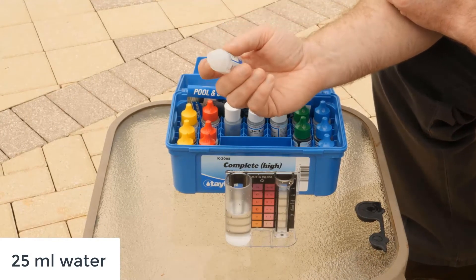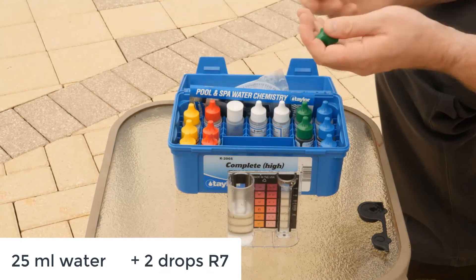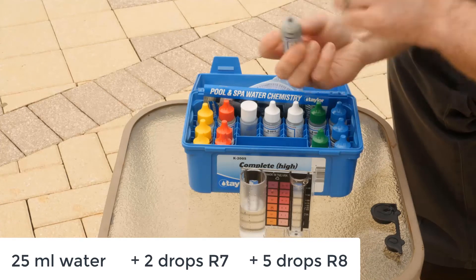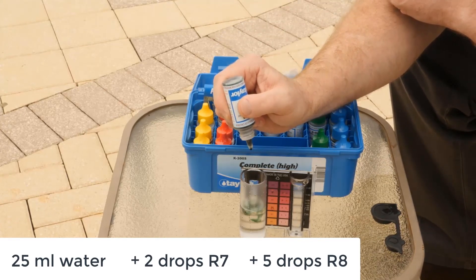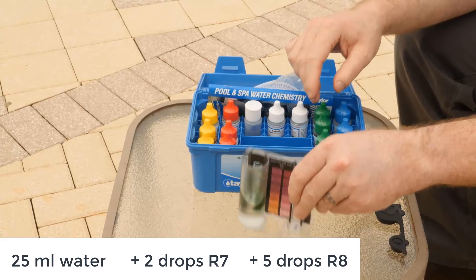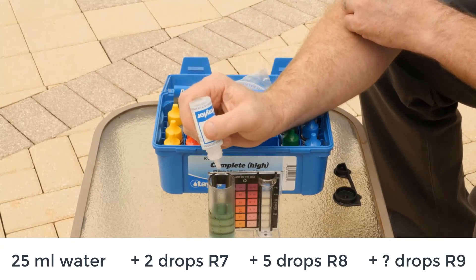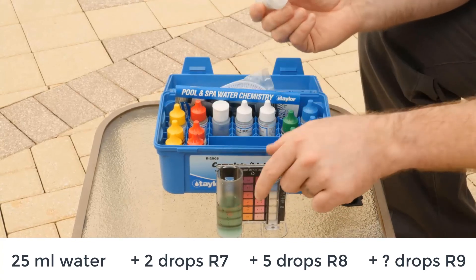To test your alkalinity, take two drops of reagent seven — hold it vertically and swirl it. Then take five drops of reagent eight and swirl it. Then take reagent number nine and place one drop, swirl, and continue doing that until the sample turns red.